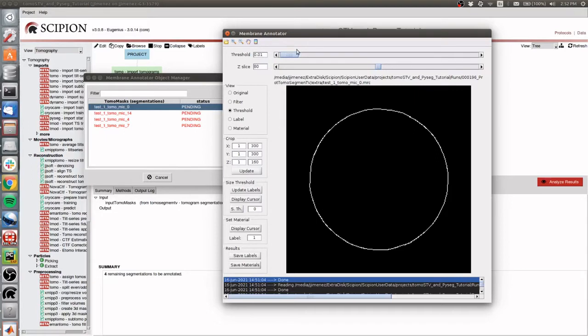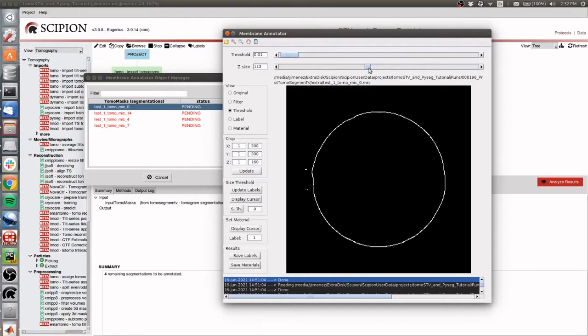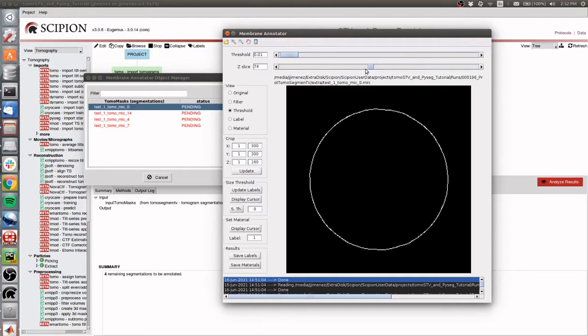But for real data, you have to play a little bit with this and also with the slice, because sometimes with real data, the circumference seems to be incomplete, with some discontinuities, and in the end it is a visual effect of the view.